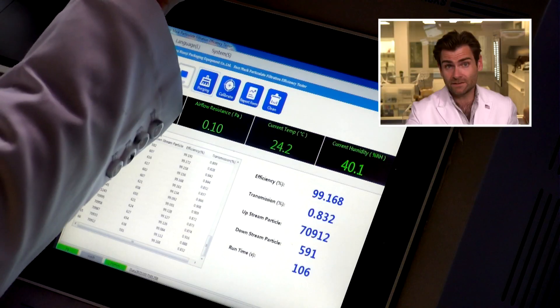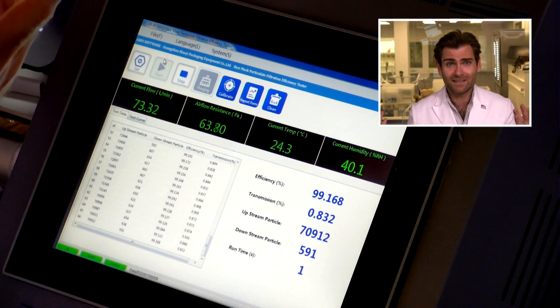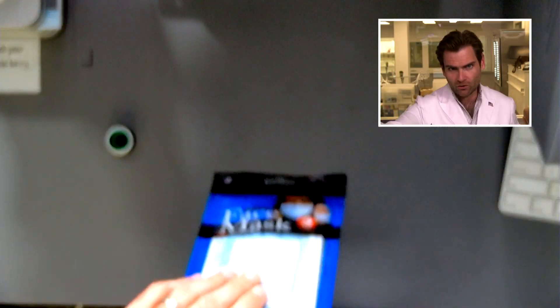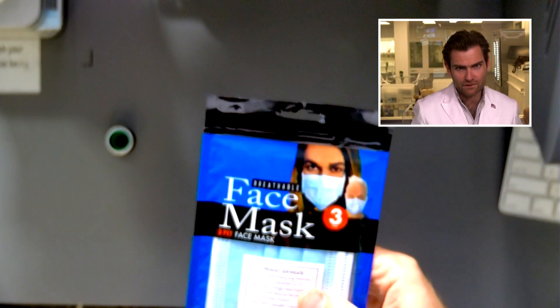If you go to CVS, you're probably not going to see this particular mask. We're having fun here, right? This is a PFE machine — particulate filtration efficiency machine. If you want to find out what this thing does, check out that link. But we're doing the ASTM test here, the American standard test.